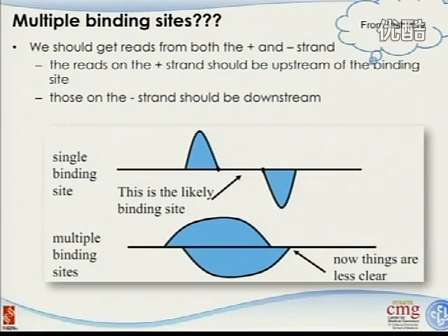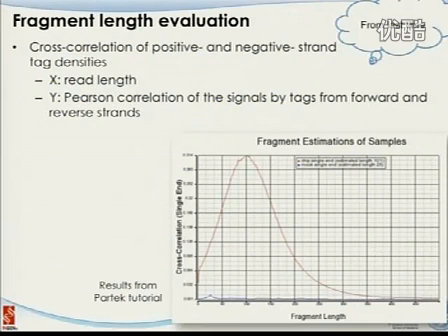Is that okay? All right. And so those are the peak finding algorithm and so on and so forth. But there's one important thing that we are using in both the tag shifting and tag extension approach, which is the DNA fragment length.